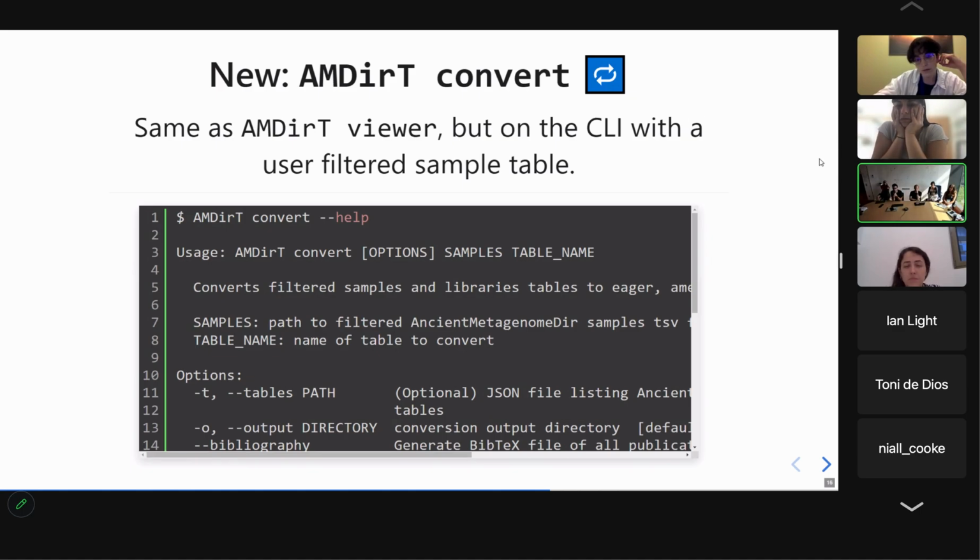It will prepare the configuration file for all of the different pipelines, the BibTeX citation entries for citing the different articles that you reuse the data from, what else is it creating? That's it. The download script also for downloading all of these samples. So it's the manual, the command line interface to view.